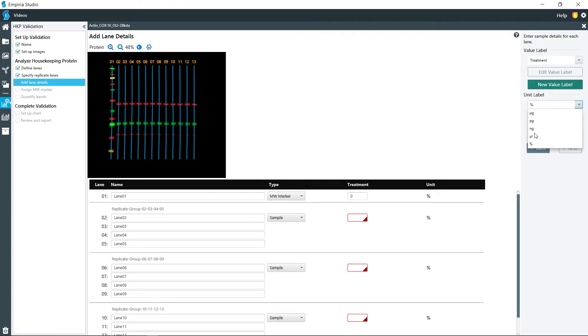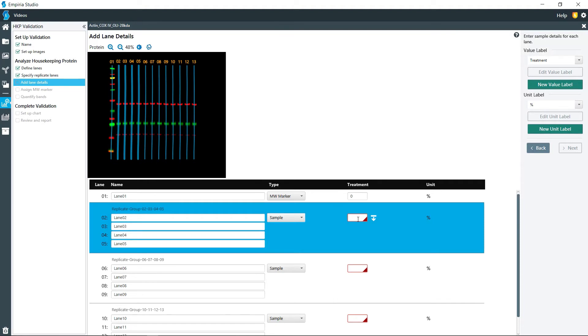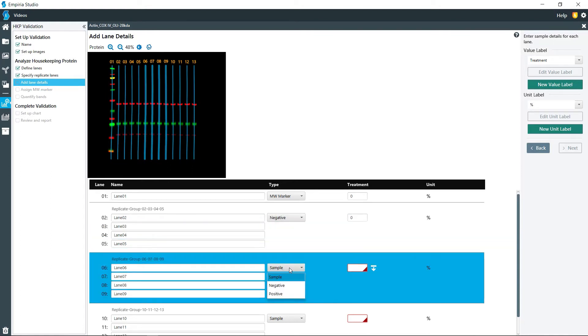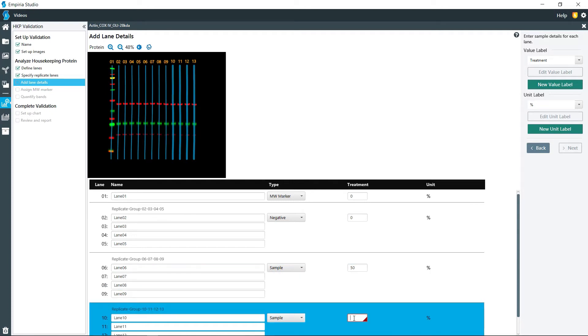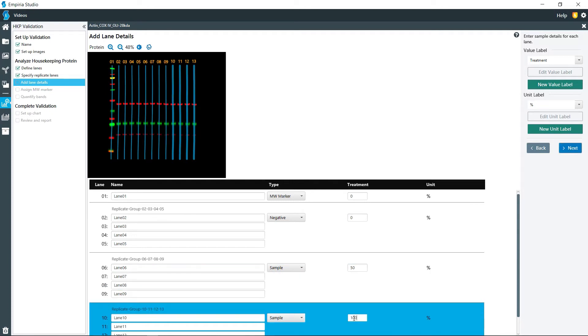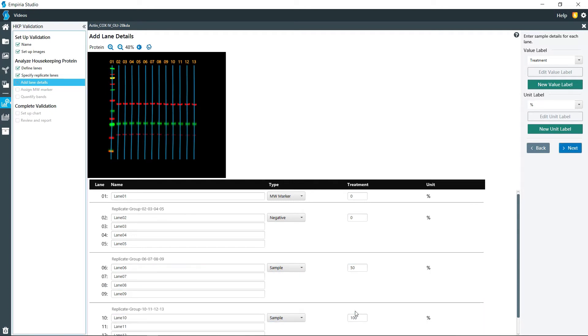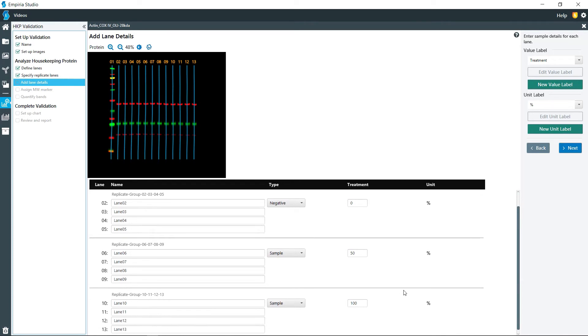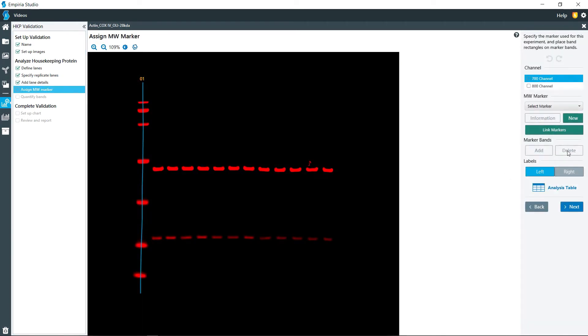You can add another label to that if you would like to, and then your units can also be in micrograms, picograms, nanograms, microliters, or percentage. You can also add a different label on there if you like. So I'm just going to say that this is my negative control with zero percent treatment, and these are samples at 50% and 100%. Then click next.